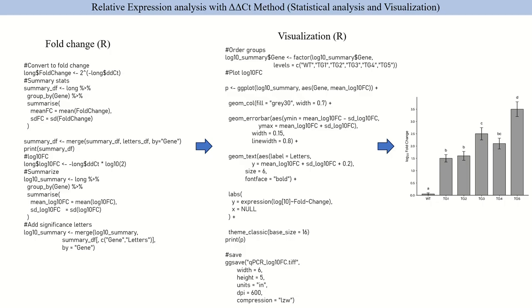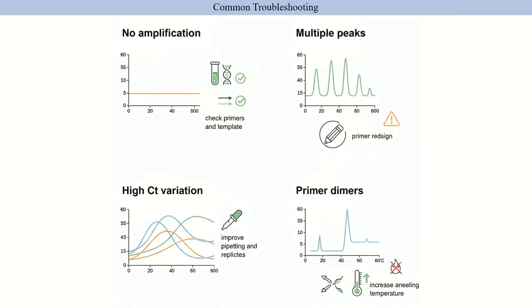If results appear abnormal, we then move into troubleshooting mode. Issues such as primer dimer, inconsistency, or flat curve can arise from poor primer design, contamination, degraded templates, or incorrect setup. Systematic checking helps resolve them. Following standard-based practice prevents most of these problems.